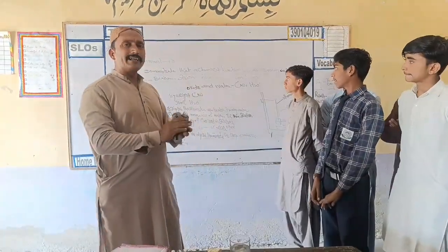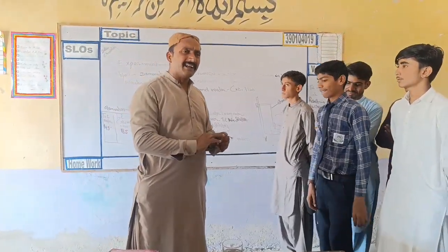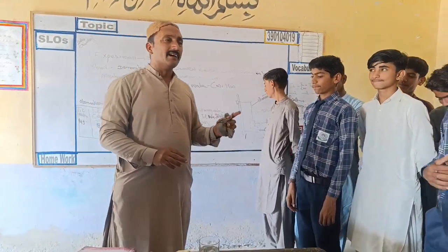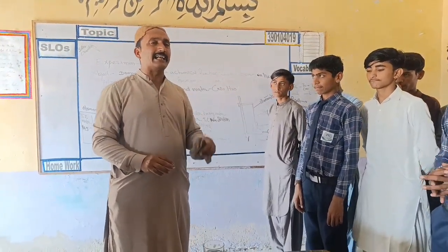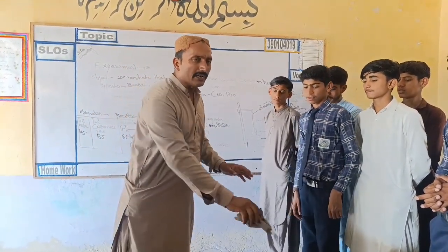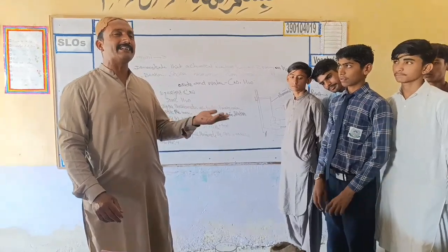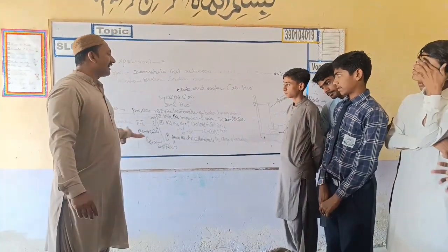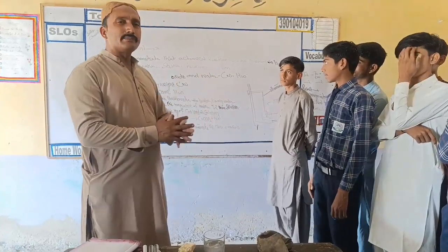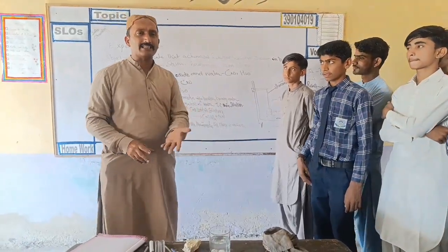This completes our experiment. The third demonstration of a chemical reaction with a change in temperature is the chemical reaction in which calcium oxide plus water is used. It is easily calculated by the change in temperature, initial and final. This is the formula; these are easily performed everywhere throughout the experiment in the class 9th Sindh textbook board exam.